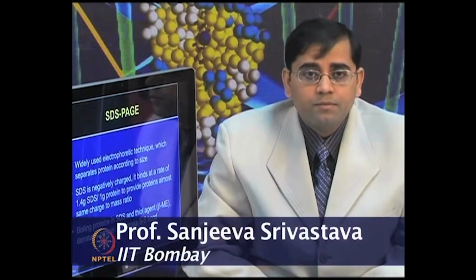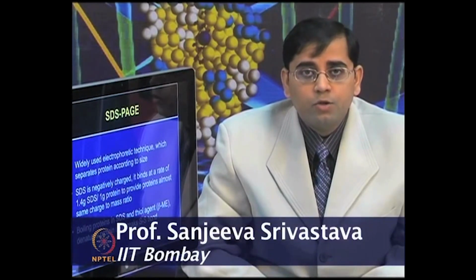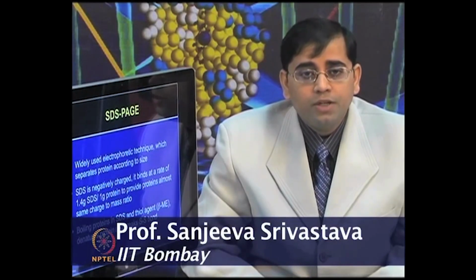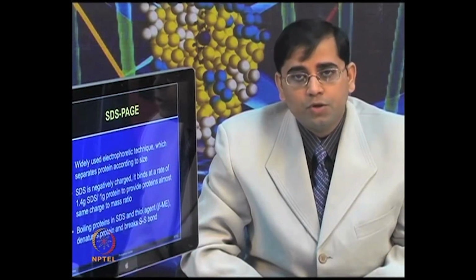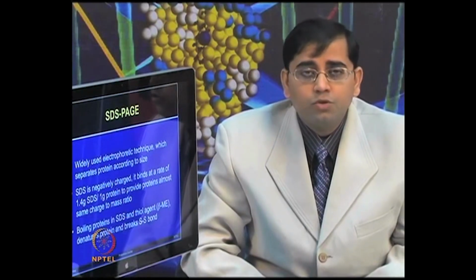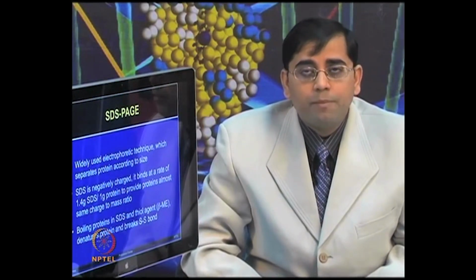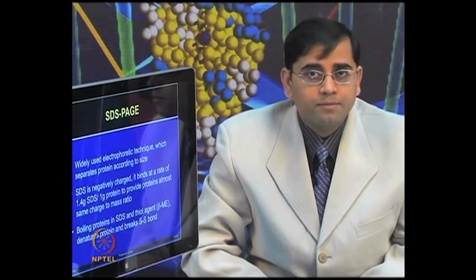As I mentioned, there are steps required to prepare your protein for denaturation. You need to boil your proteins in SDS and beta mercaptoethanol or DTT to denature the protein and to break any disulfide bonds.